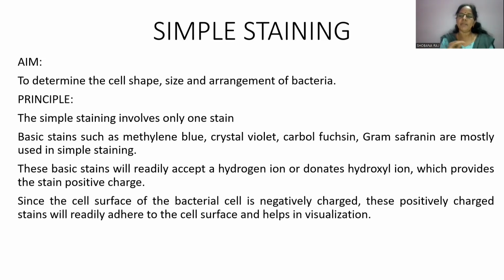So we know that the bacterial cell wall, the cell surface, is negatively charged. So these positively charged stains will readily adhere to the cell surface, and this helps in visualization. So only the arrangement, shape and size of the bacteria can be visualized by this method.